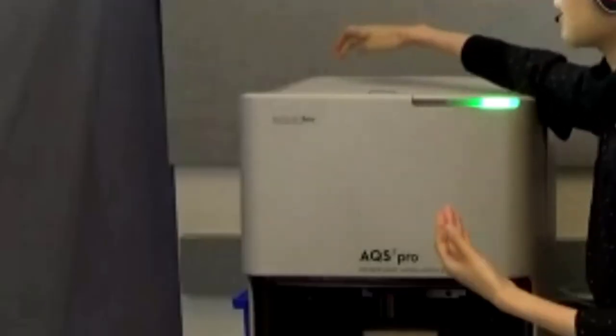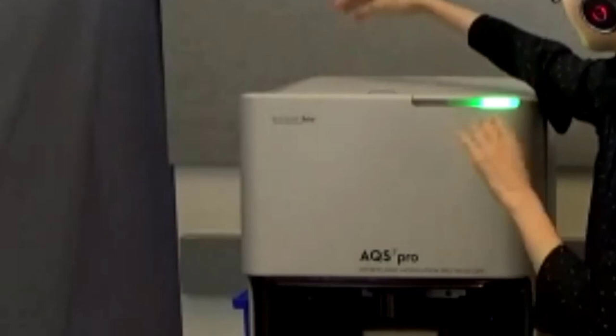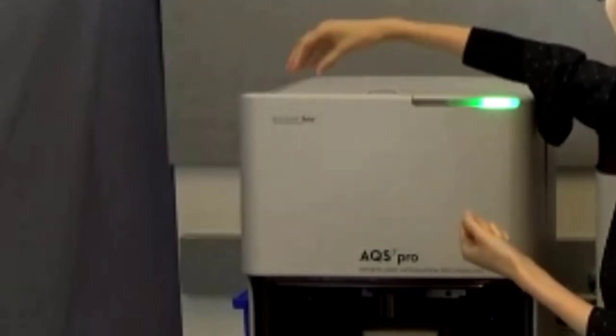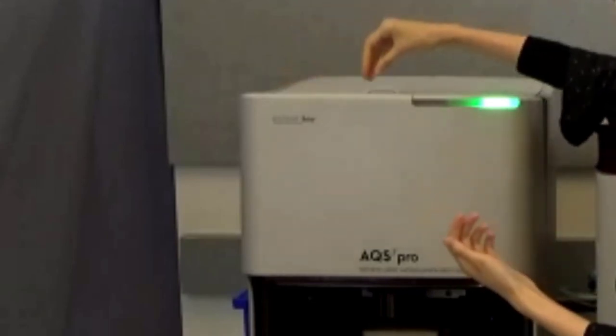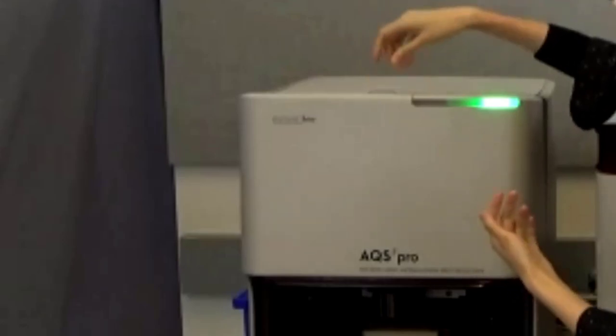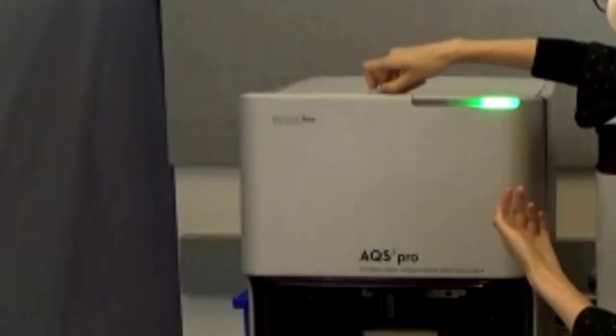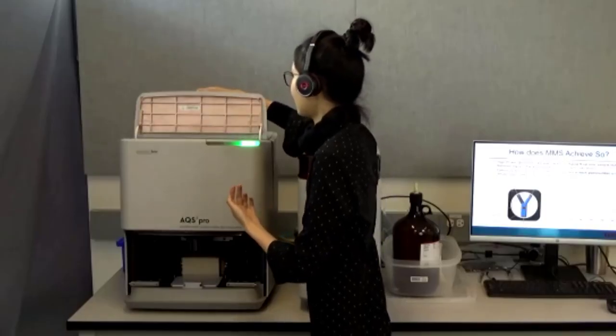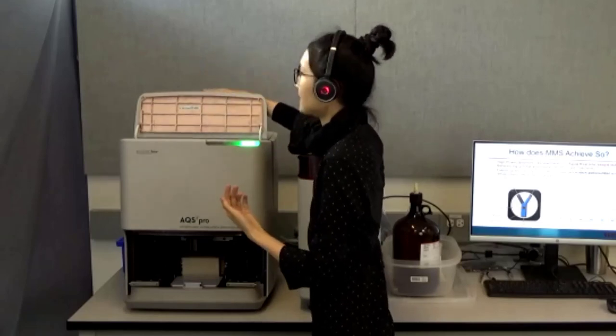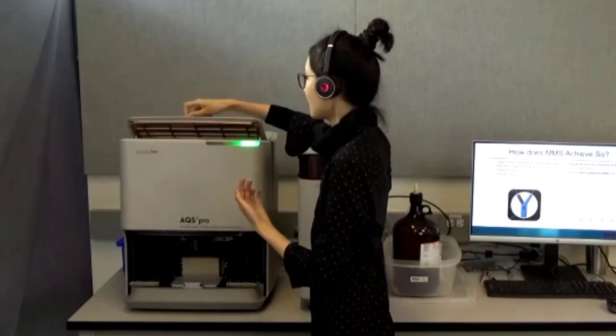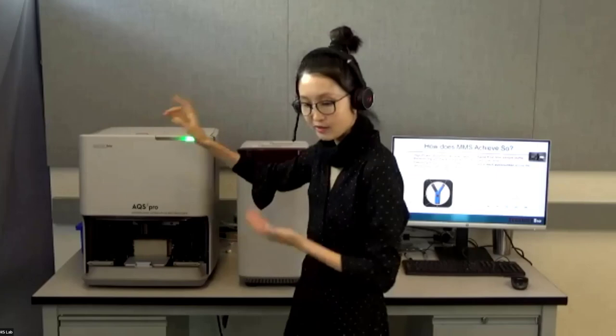In the optical bench, we have the quantum cascade laser somewhere over here and the detectors, some mirrors and the filter and also the flow cell. If you lift this, it allows you to quickly and easily change the flow cell if you need to.